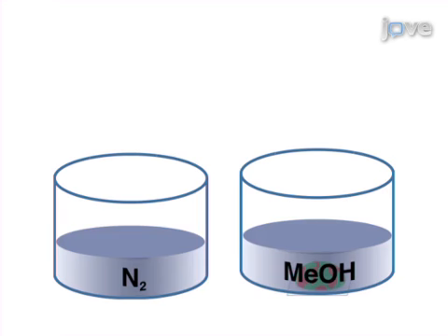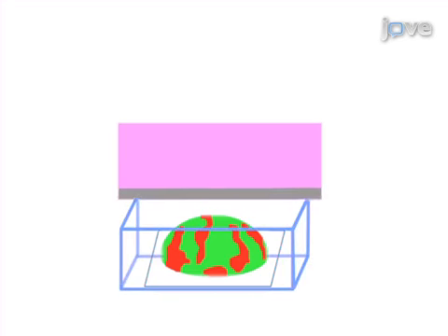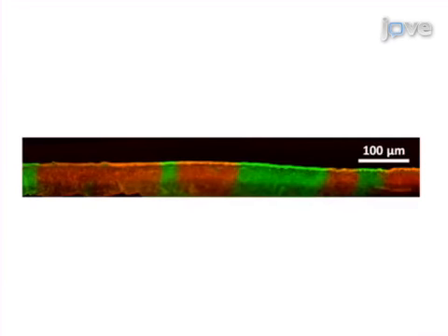cells in the community. As the second step, the methanol is evaporated to allow penetration of the embedding OCT compound. The embedded community is then frozen in preparation for cryosectioning. Next, a cryotome sections the community and cross-sections can be imaged under a fluorescence microscope. Results are obtained that show the spatial distribution of fluorescent cell populations inside a community.